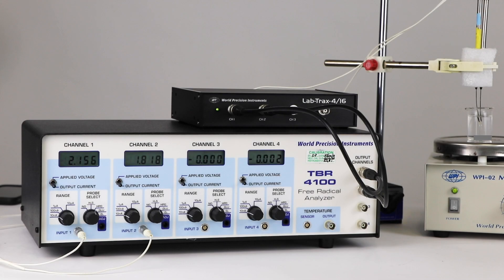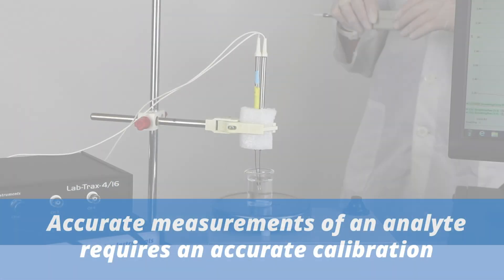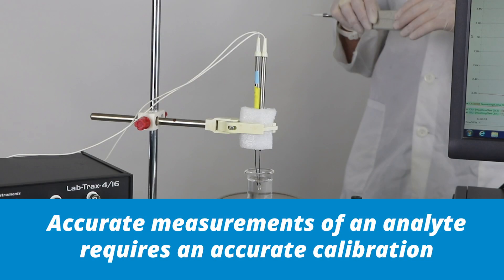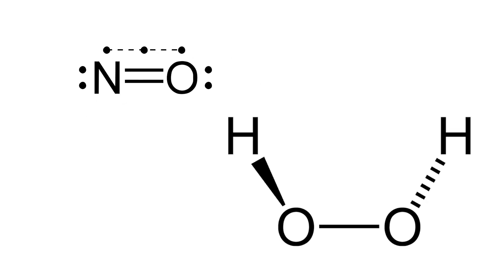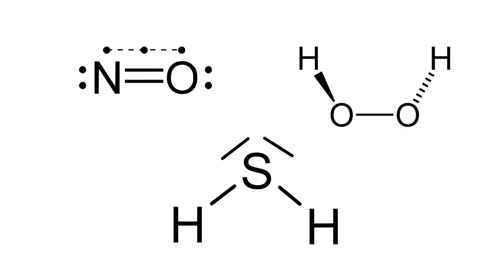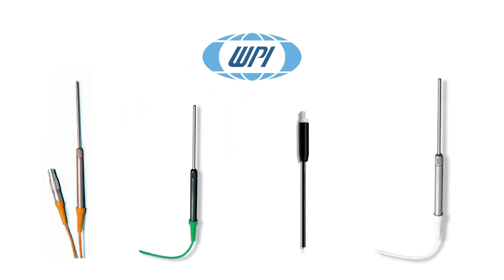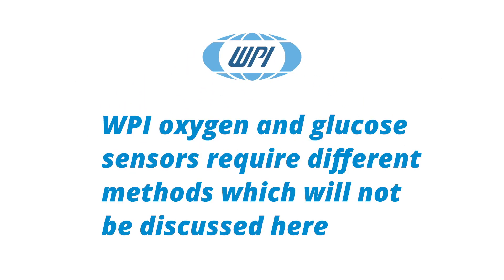When using a TBR free radical analyzer, accurate measurements of an analyte require an accurate calibration. The calibration of nitric oxide, hydrogen peroxide, and hydrogen sulfide sensors is very similar. WPI oxygen and glucose sensors require different methods, which will not be discussed here.